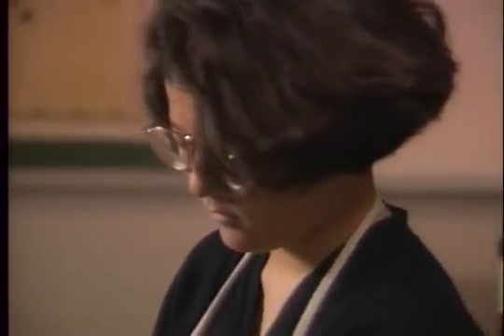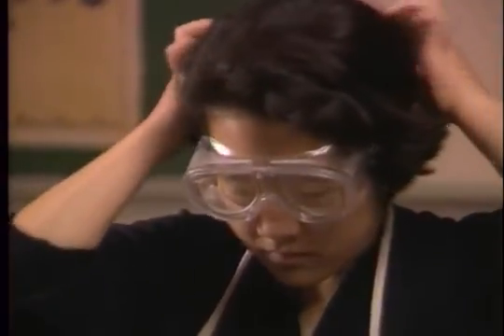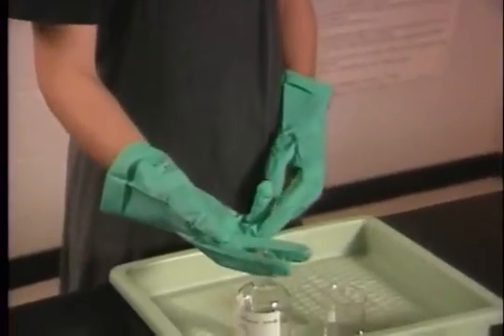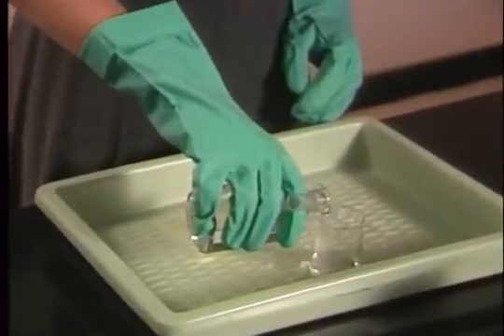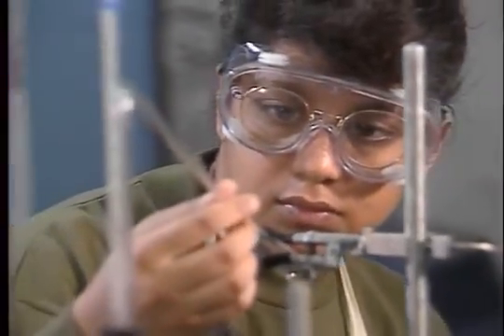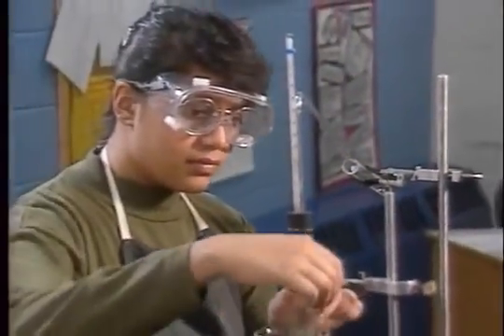Always wear goggles with side shields to completely protect your eyes, even if you're already wearing glasses. And finally, protect your hands. Never use bare hands with concentrated acids, bases, or other reactive chemicals, such as concentrated hydrogen peroxide. Your teacher will tell you what type of gloves to wear to work with these chemicals. With the right clothes and protective equipment, you can work with laboratory chemicals with confidence and safety.